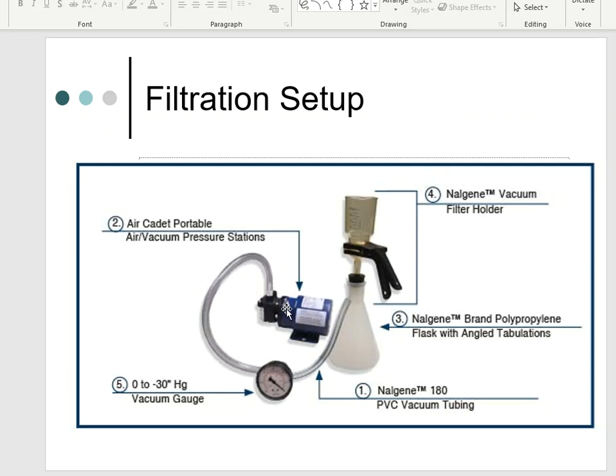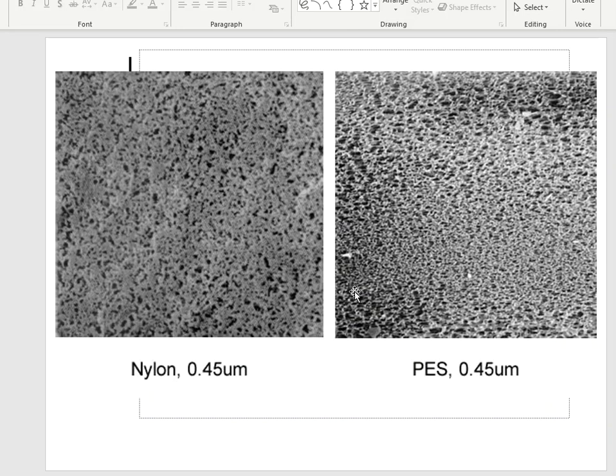and what you're seeing here is an external pump. And these can be used in the lab. You don't need a sink basin in order to create a vacuum aspirator. The sink will allow some suction to come through, and it's a very convenient way for us to do it. But if we had a standalone pump, then that would allow us to do that as well. So that's what you're seeing right here. This pump is creating the suction that's needed to pull this mobile phase through so that this process can happen much quicker.